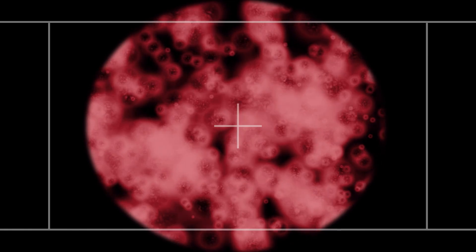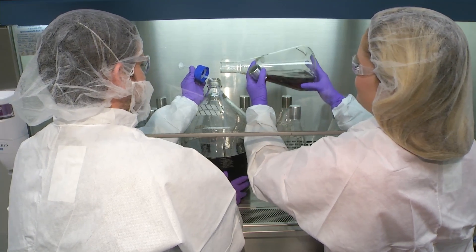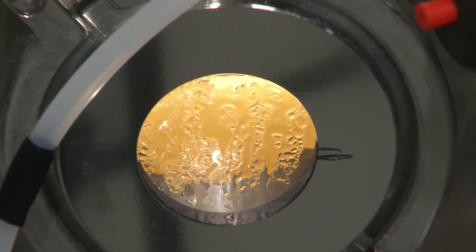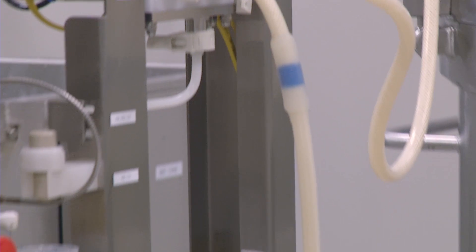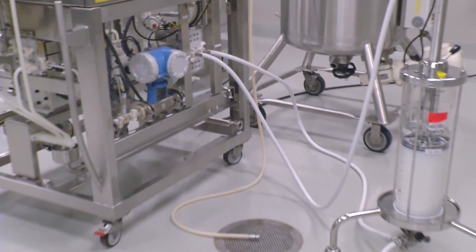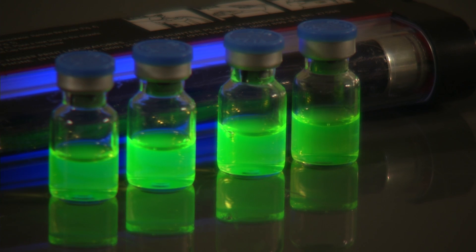Fermentation is basically cell farming. We program cells to produce a product, nurture them as they grow and reproduce, and then harvest them. In recovery, we separate our product from the cells where they were housed. And then in purification, we go a step further by removing everything else that's contaminating our product, leaving us with a very pure, concentrated solution.